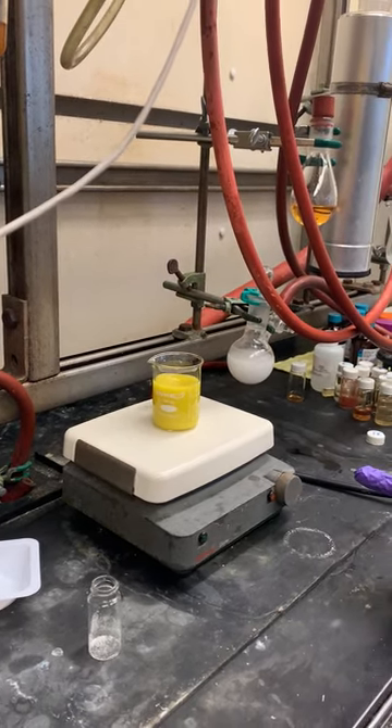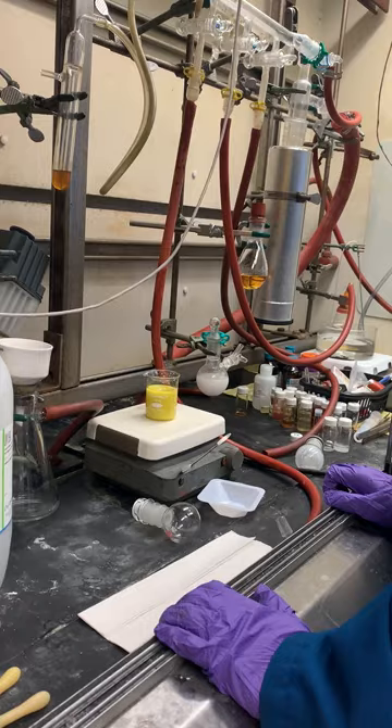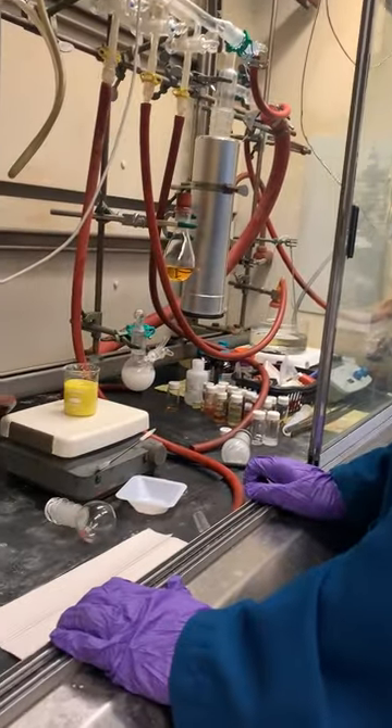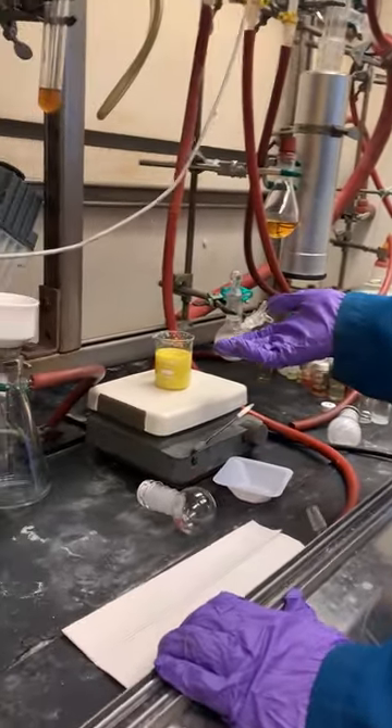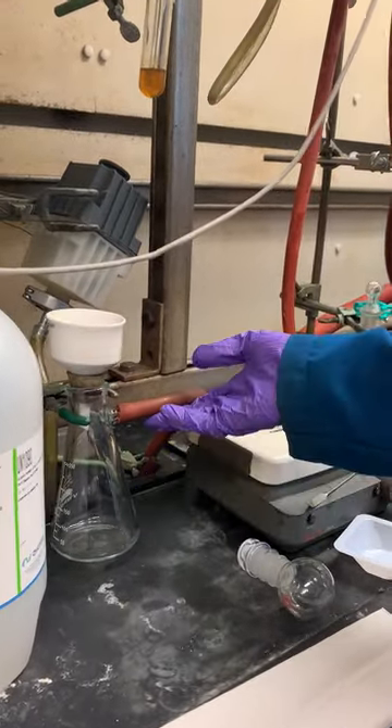The reaction is probably mostly done, but we're going to let this stir for maybe 15 to 30 minutes to make sure everything's complete, and then we'll come back and filter it. Now we're back — it's been about 15 minutes and we're ready to filter.